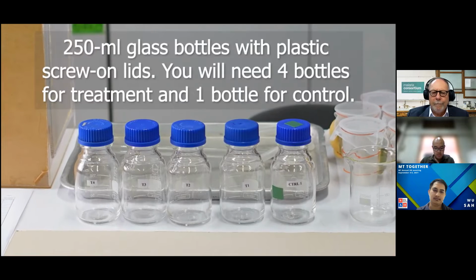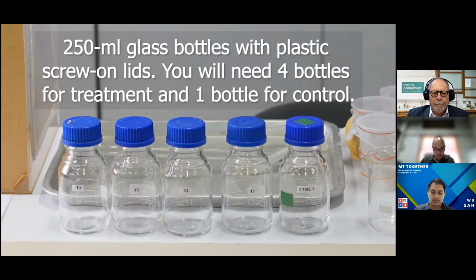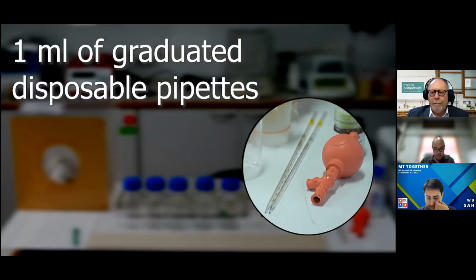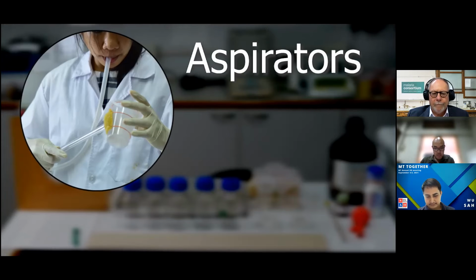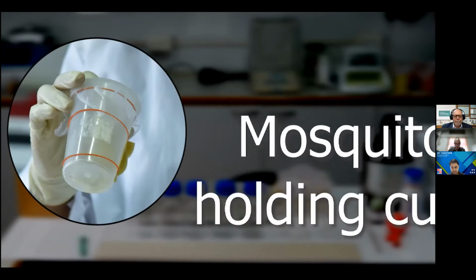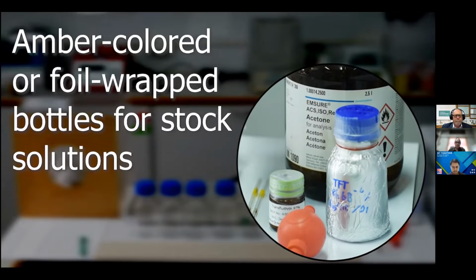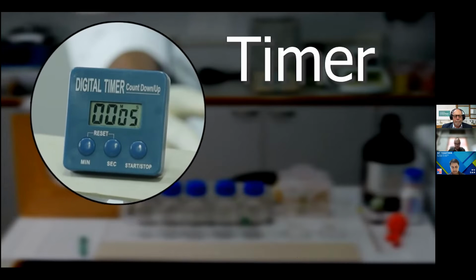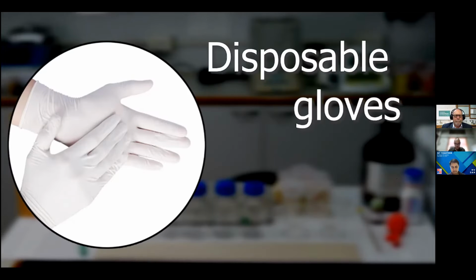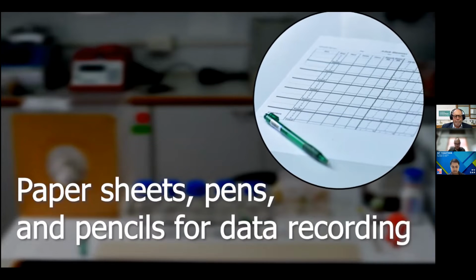250 milliliter glass bottles with plastic screw-on lids, 1 milliliter graduated disposable pipettes, aspirators to transfer mosquitoes, the mosquitoes themselves, mosquito holding cups, amber-colored or foil-wrapped bottles for stock solutions, a timer, permanent marker pens, disposable gloves, paper sheets, pens and pencils for data recording.